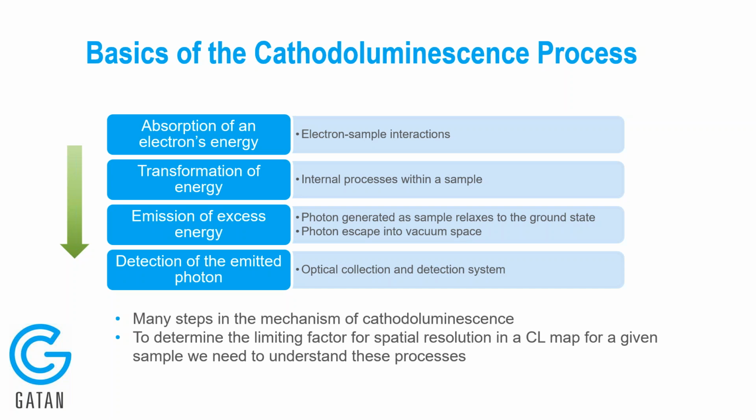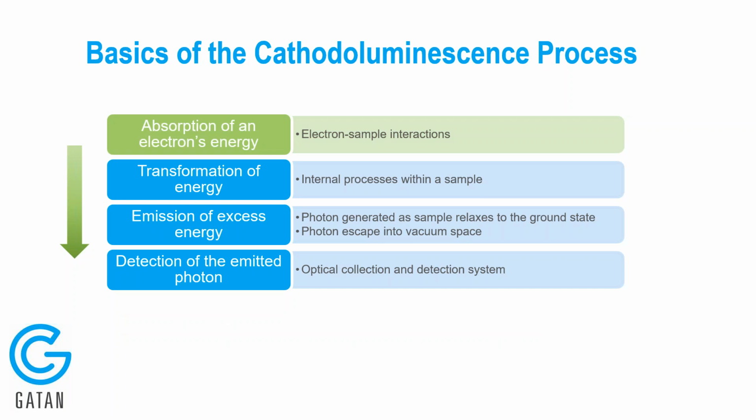In order to understand which one of these effects is the limiting factor, I'm going to walk you through this process in a few steps, because depending on exactly the sample type, the limiting factor may be a different part of the process. So let's first of all start by looking at the very first step, how the electron and the sample interact together.